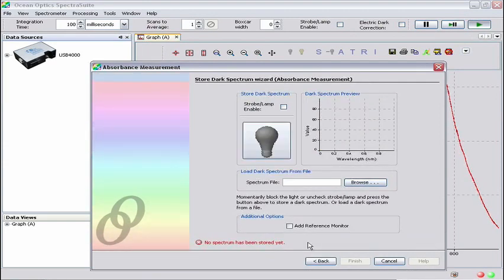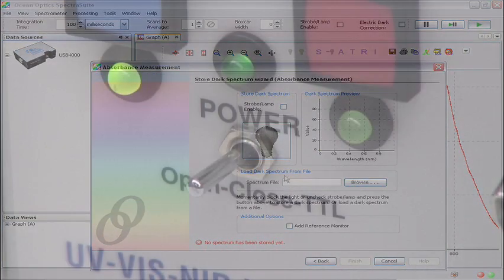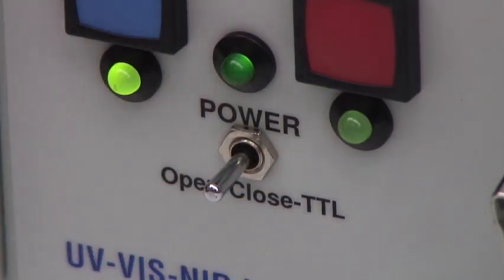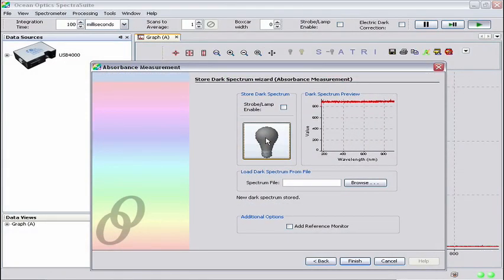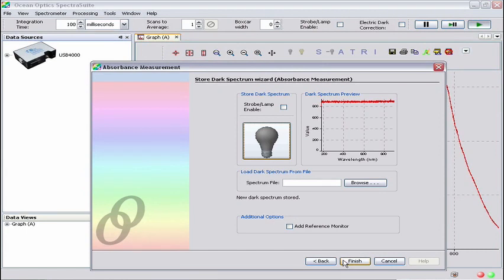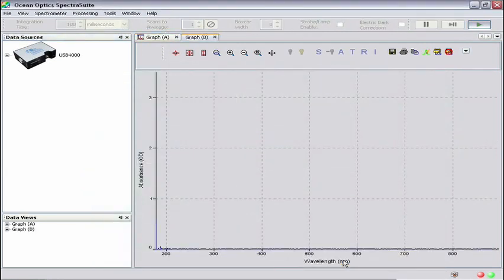Now click Next. This is the Store Dark Spectrum Wizard. Move the shutter switch to the middle or closed position and then click the grey lightbulb button to store the dark spectrum. Once you have stored the dark, you'll see a preview of it in the Dark Spectrum preview pane. After storing the dark, move the shutter switch to the open position and click Finish to exit the wizard. We are now back at the main SpectraSuite window. Here you'll see a new graph showing zero absorbance. This is Graph B. It's showing zero absorbance because it's measuring our reference, which is blank.